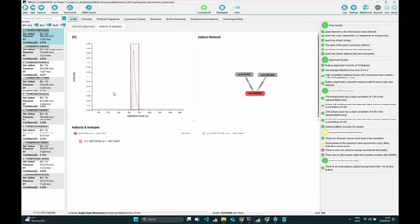Okay. Hi, thanks for the presentation. You mentioned at some point that it's possible to upload your custom database or a spectral library as well. I was wondering, how do you do that? I have a spectral library that we created in-house, and we have an MGF or MSP file in which we have SMILES codes and we have a spectrum, MS2 and intensity for all the ions. If I upload it, will it be in the software already, and I don't have to upload it several times?